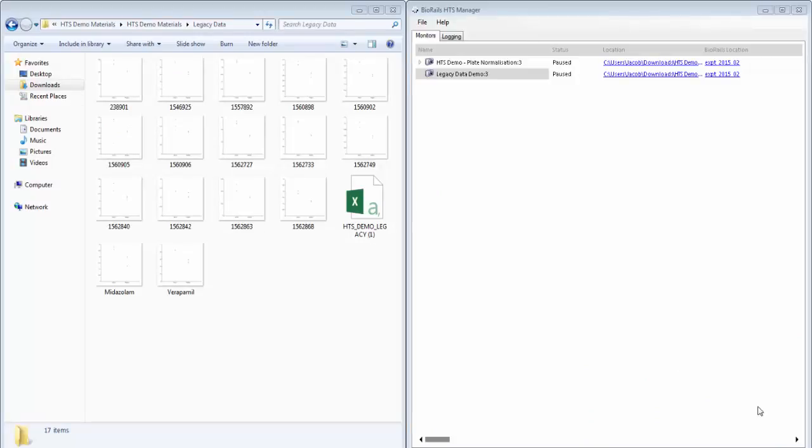I'm now going to run through the legacy data loading features of BioRails HTS. HTS's legacy data loading solution ensures that previous experiment results can easily be stored along with any new results that you wish to create. Results files can be uploaded in large volumes along with their associated charts and files for specified BioRails tasks.